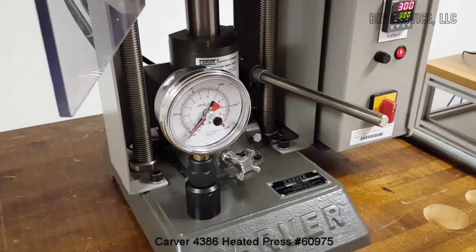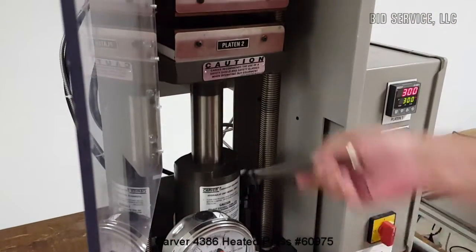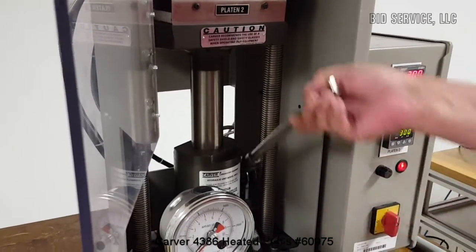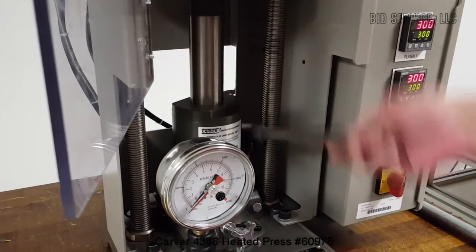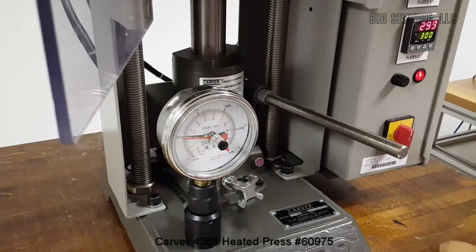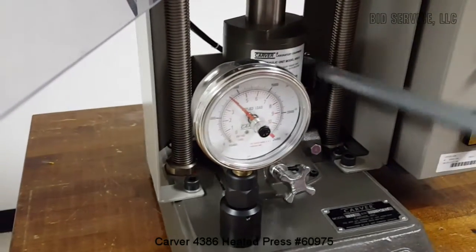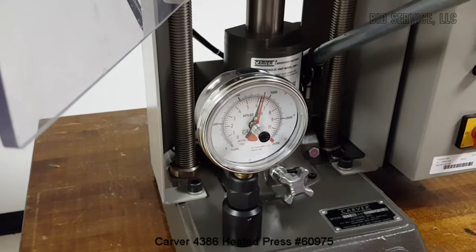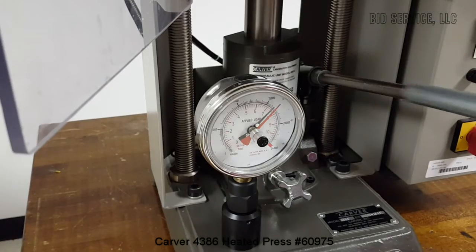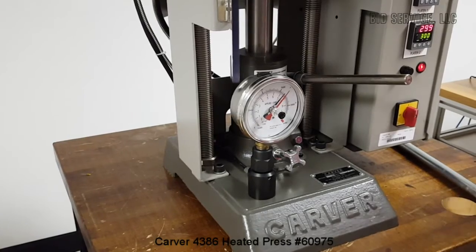To pump it up, make sure the valve is closed tightly, then put your sample in. You should be able to do a little bit by hand. It comes with this extension bar, and you can use that to pump it up to your desired pressure.